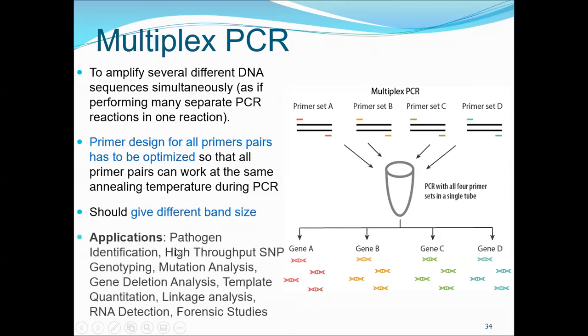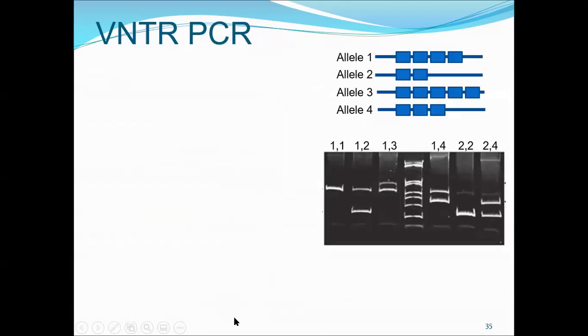So it has got several applications like pathogen identification, high throughput single nucleotide polymorphism genotyping, then mutation analysis, gene deletion analysis, linkage analysis, DNA, RNA detection, and forensic studies.